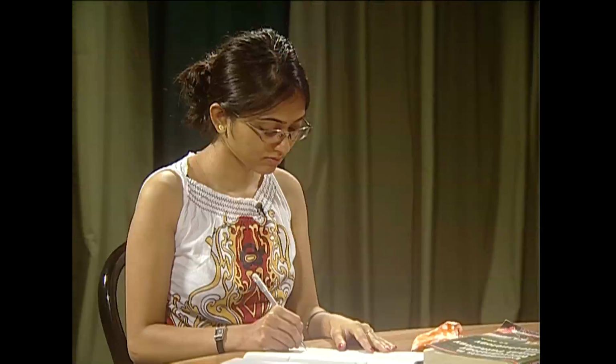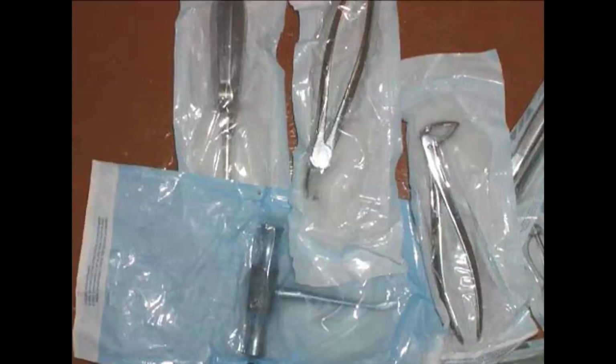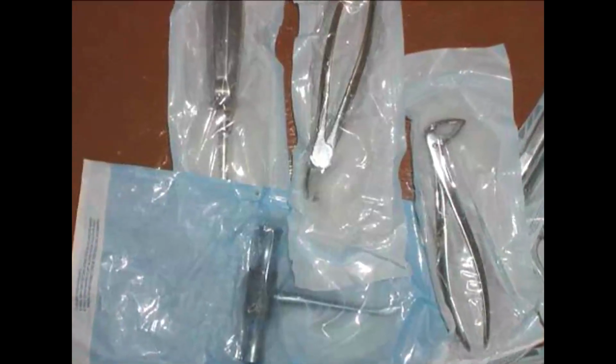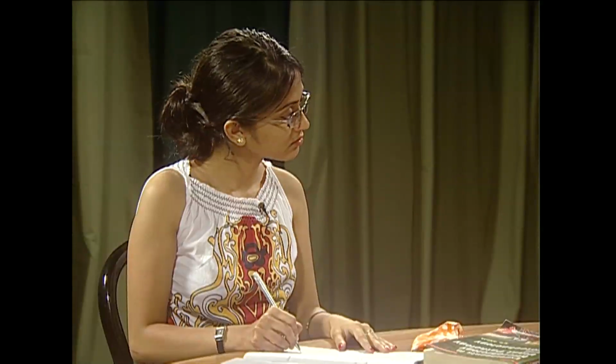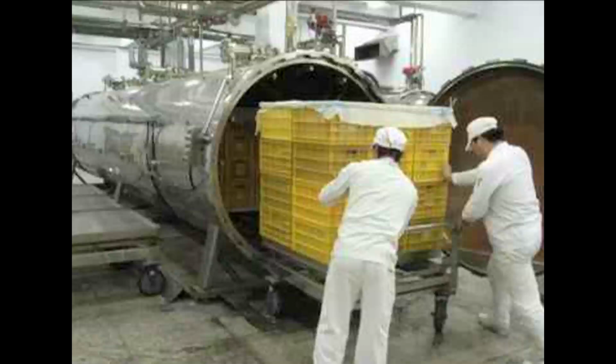The things that can be sterilized in autoclaving are mostly used in hospitals and laboratories. It is used for the sterilization of growth media for the microbes, of surgical instruments, and of various glasswares. It can be used for sterilizing blankets, operation theatre used labwares, and many more things. The applications of the autoclave are really endless.